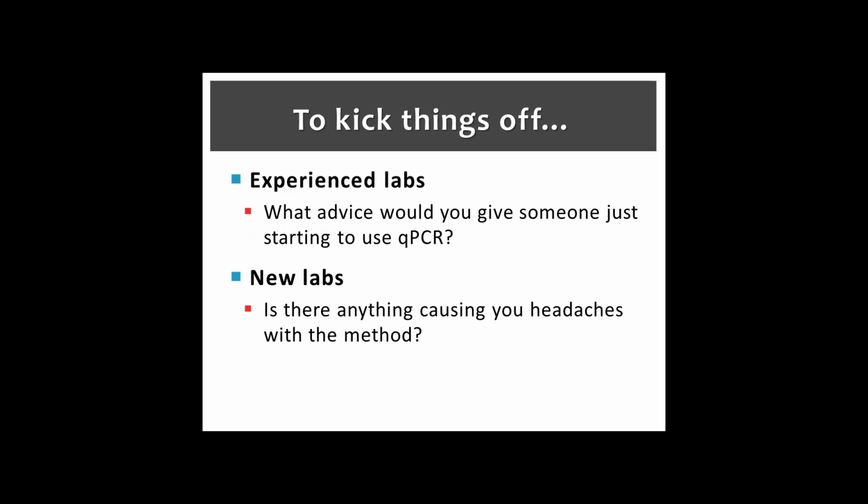No, we just use regular pipette tips. Can you repeat the question? Oh, the question is about pipetting problems. You cannot see the small volume that flows through. We usually use clear color pipette tips. I believe it's hard to see, especially when you pipette less than 10 microliters, but you just have to believe that it works. I'm not sure whether different kinds of pipette tips can help to better see the liquids flowing through the pipette tips. Maybe is there anybody who has experience with pipette tips?